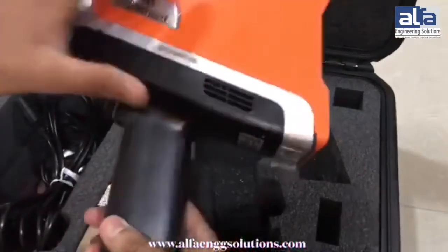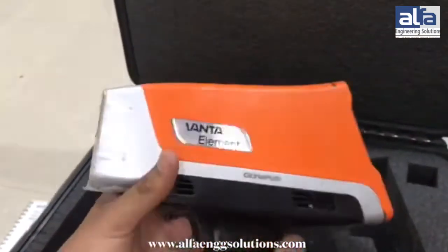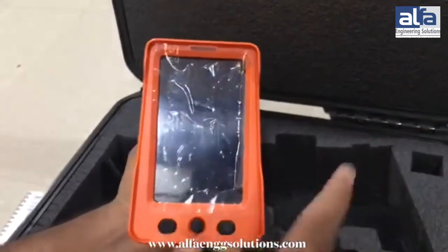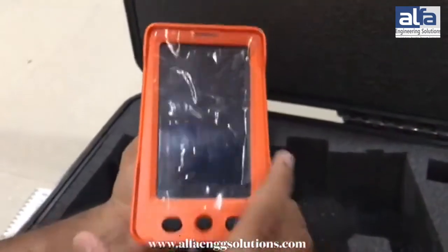This is the XRF analyzer. This is the screen in which all the data will be shown, and these are the control buttons to control the screen.